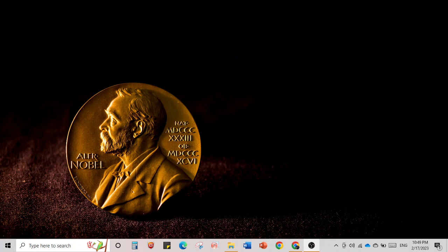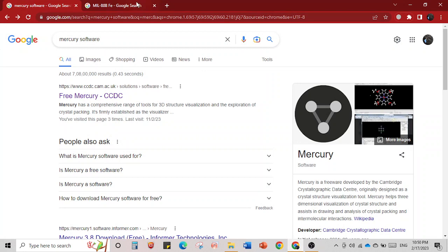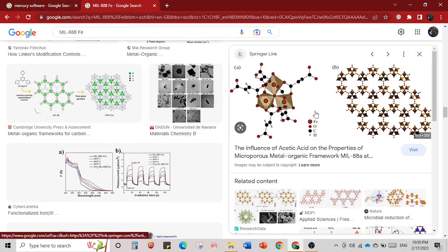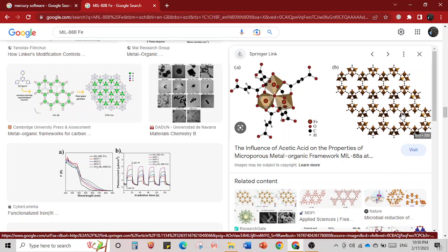Hello everyone. In today's video we will be seeing how to make crystallographic data from a CIF file for a MOF. By the end of this video I will make sure that you are able to create beautiful pictures of your MOF or crystal files available in the literature to represent in your presentation or paper.